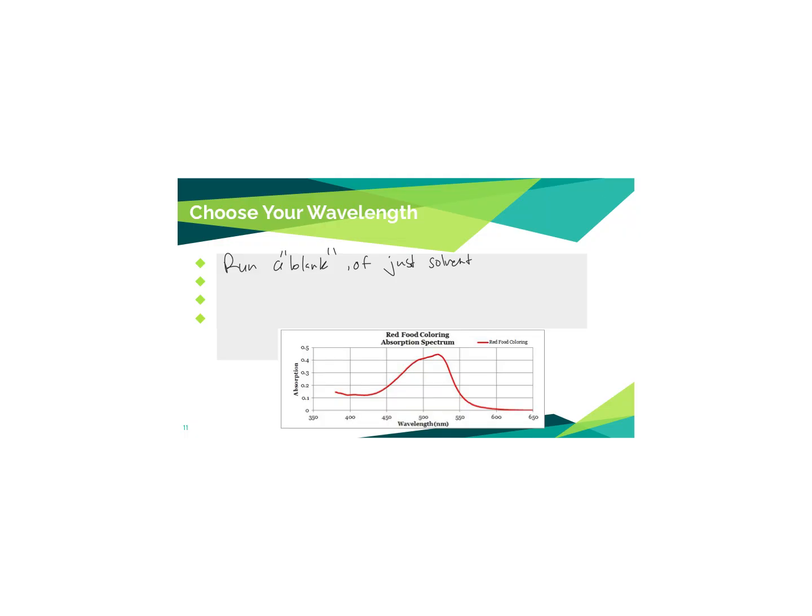And so you would just measure how much light your solvent absorbs. Then you would place your sample in a cuvette, then in the spectrophotometer, and then you would just test absorbance at your wavelength of interest.